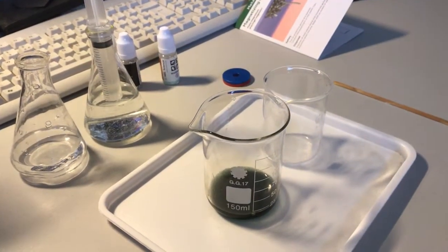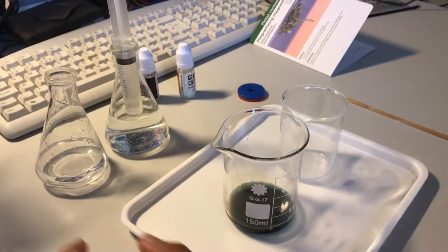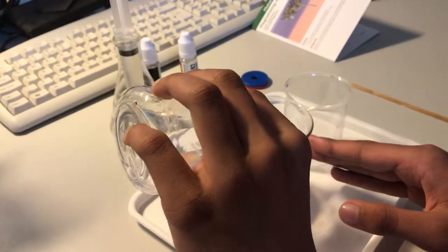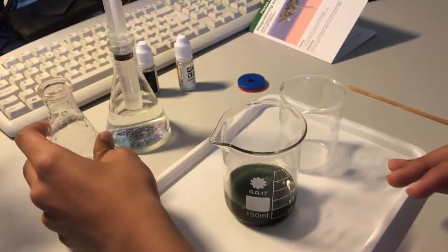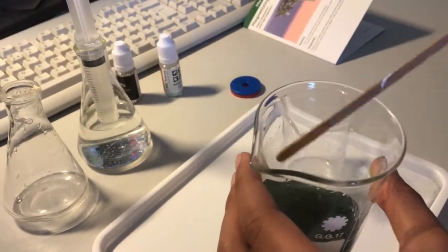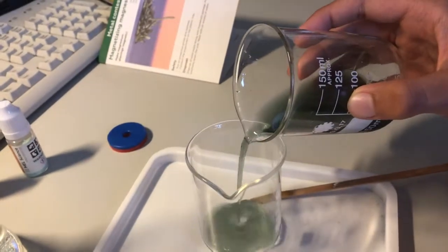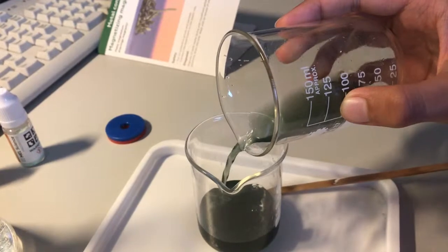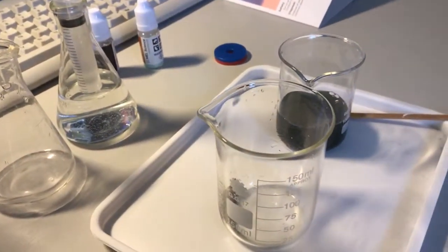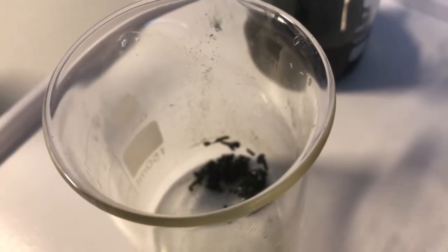After the 20 minutes, add another 30ml of water into the mixture and carefully pour out the water. We then add another 10ml of water and we'll see if this new compound reacts with a magnet.